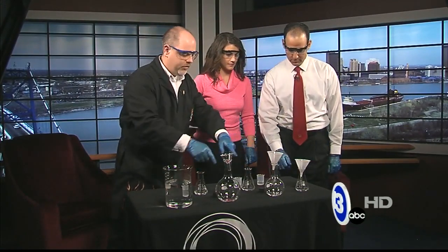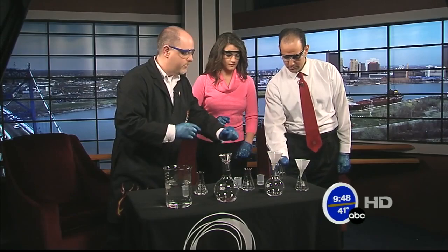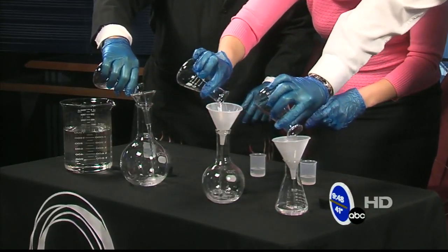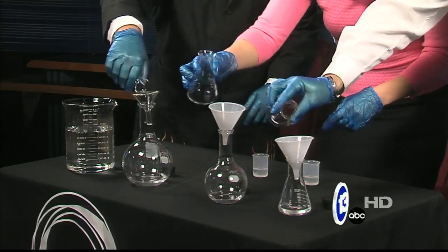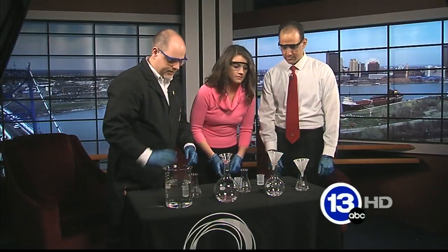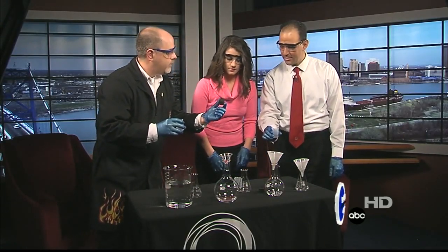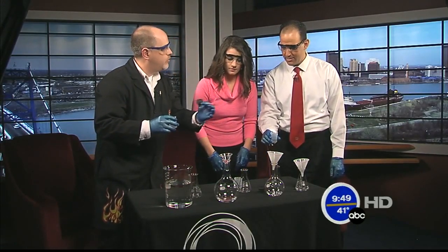First thing you do — we each have our own little container here. We're going to start with the flasks. Go ahead and pour that liquid into there. So there's actually two reactions that are happening here. We can put those aside. Now the next step are these little beakers. We're going to add this and then cork it, pick up your flask and swirl it around.